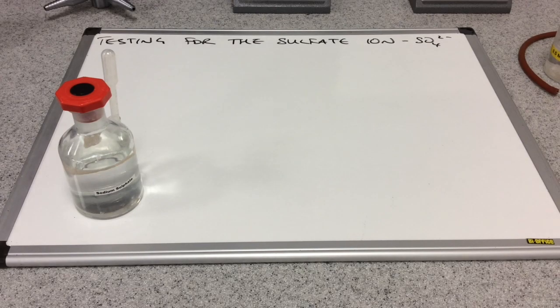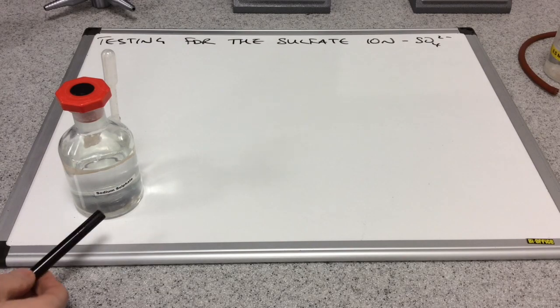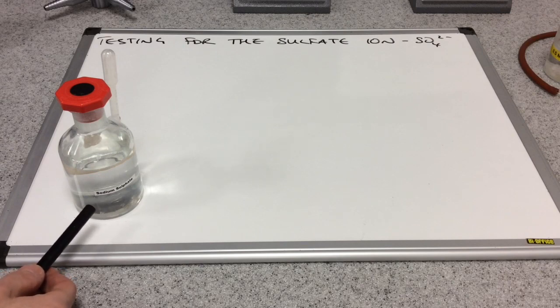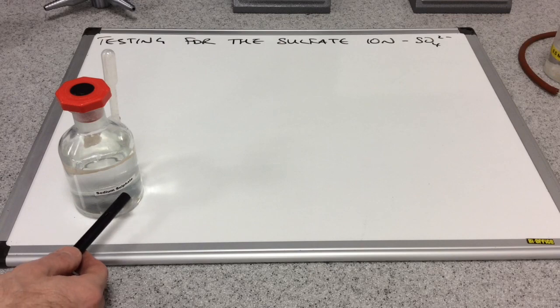In this video I'm going to look at the test for the sulfate ion, the SO4 2- ion. You can see at the left here I've got a bottle of sodium sulfate solution, and contained within this bottle is that sulfate ion.